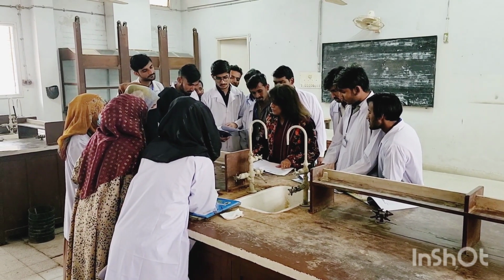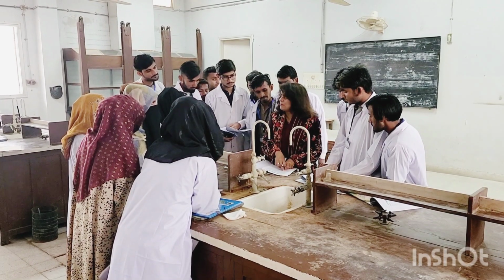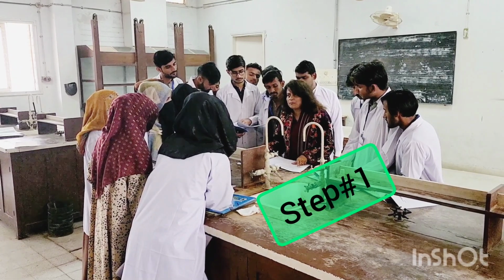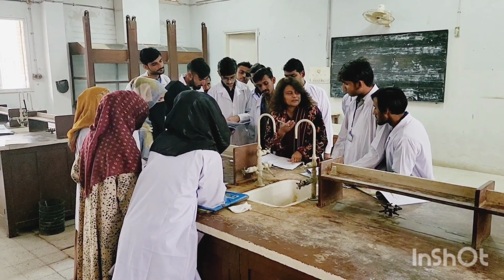Now, this object will remain the same for all the steps. Today, we are doing step number 1, that is the preliminary examination. So, this is step number 1. Next time when you do the detection of elements, that will be step number 2.